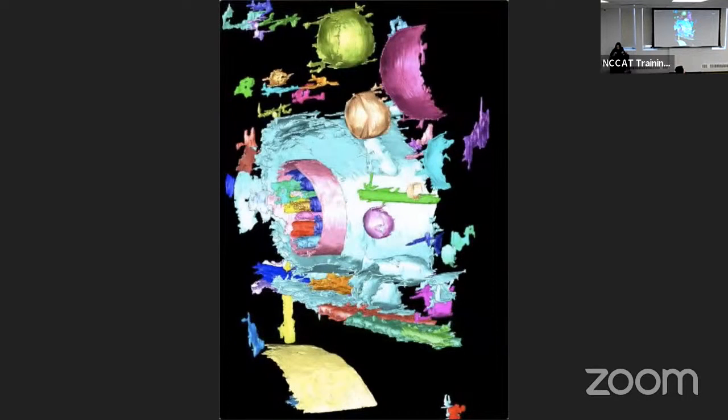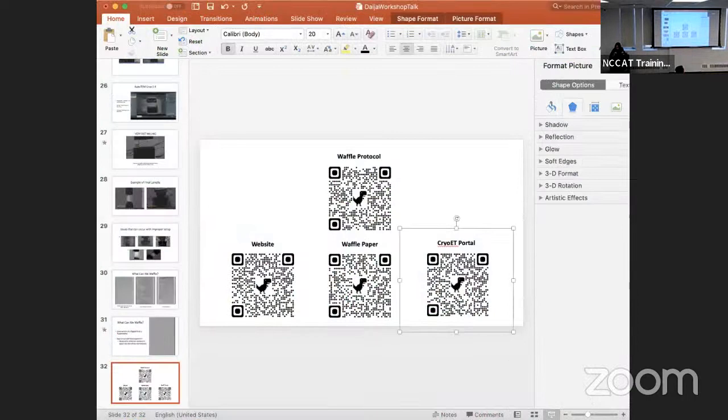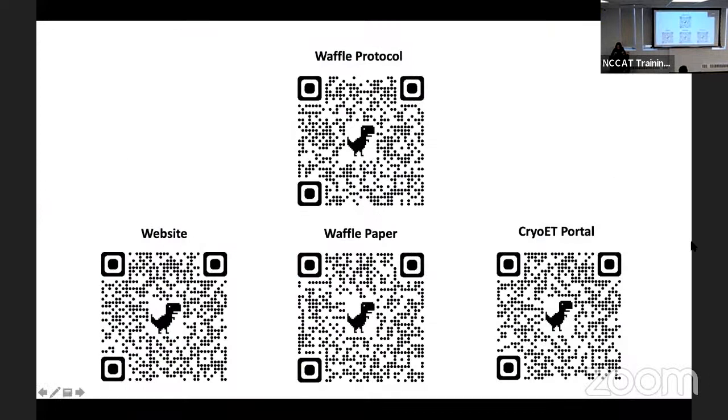Okay, let's get back to this. So that's basically the end. I've included all the QR codes for everything super important. The topmost one is the most important because it has very good details and videos on how to do the waffle method, from actually using the HPF all the way to the milling. So if you have any questions after you read that, feel free to email me.